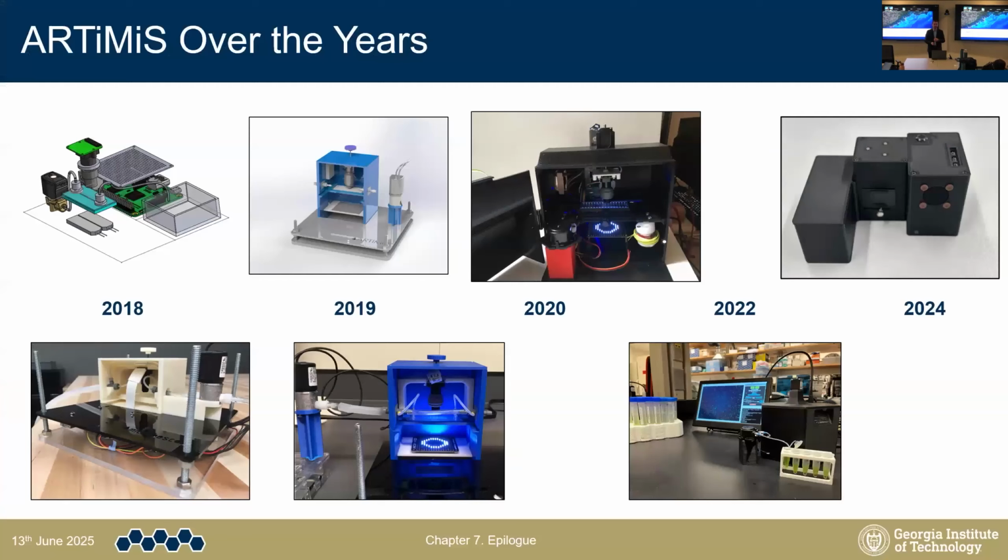All right, so let's wrap it up here. I just want to show you real quick, because Amit had mentioned in the beginning, this is a view of what ARTiMiS had looked like over the years. So all the way on the left there in 2018, that's the prototype of ARTiMiS when it was in Capstone. And over the years, there's been a lot of design iterations and improvements. Most of the pictures that I've shown in this presentation have been that hexagon version, so it's the 2022 variant. The current one looks a little bit different. That's the one in the top right, and that one is pretty much ready to go as a product to ship. So that's really exciting.